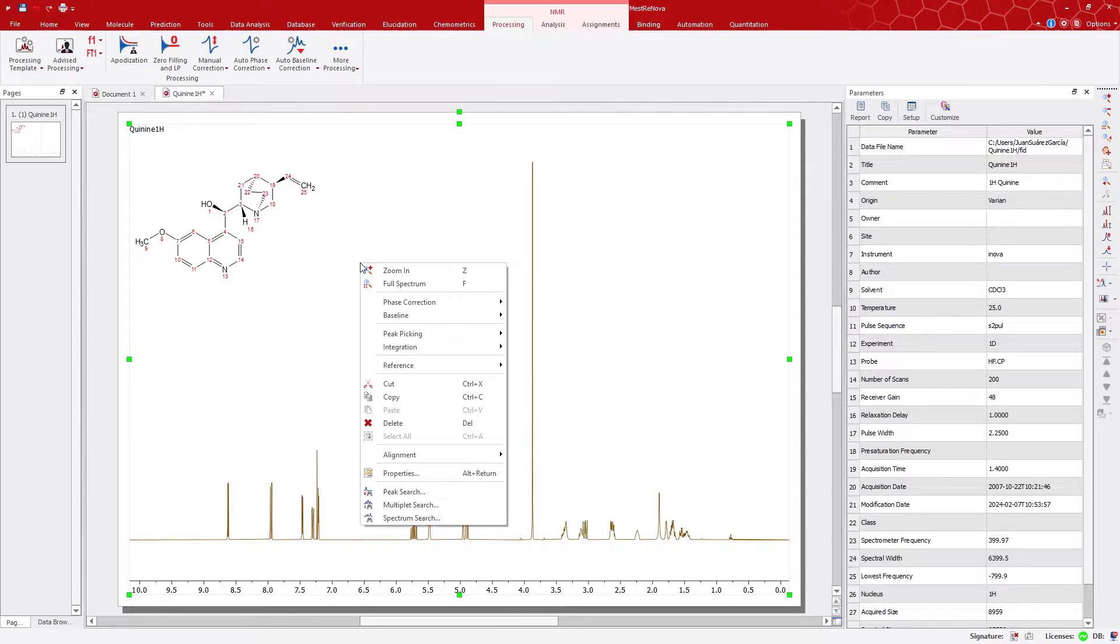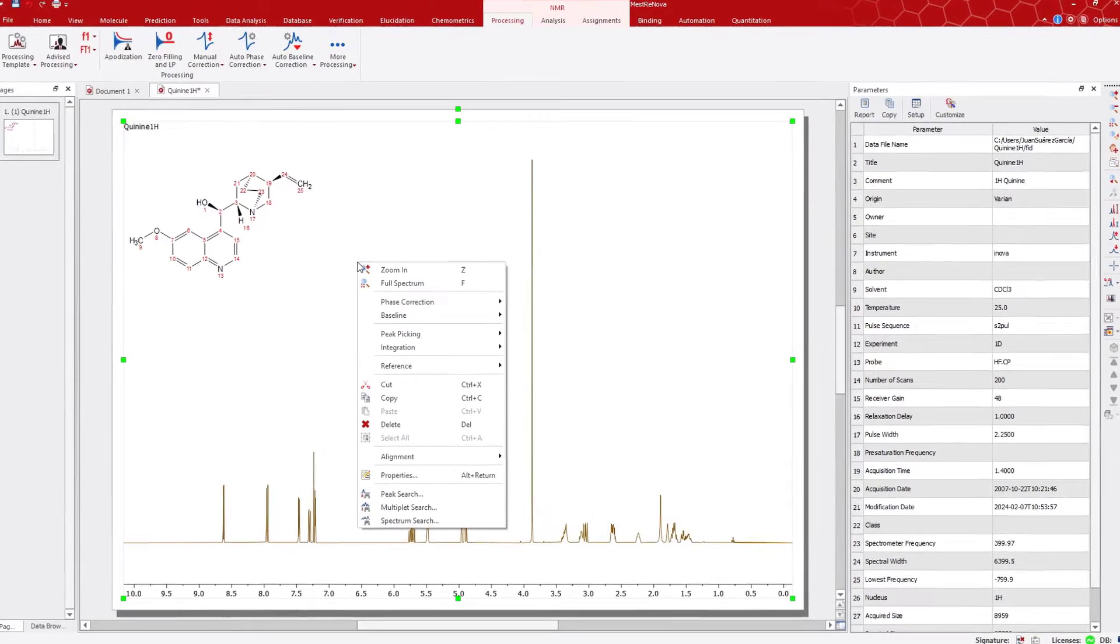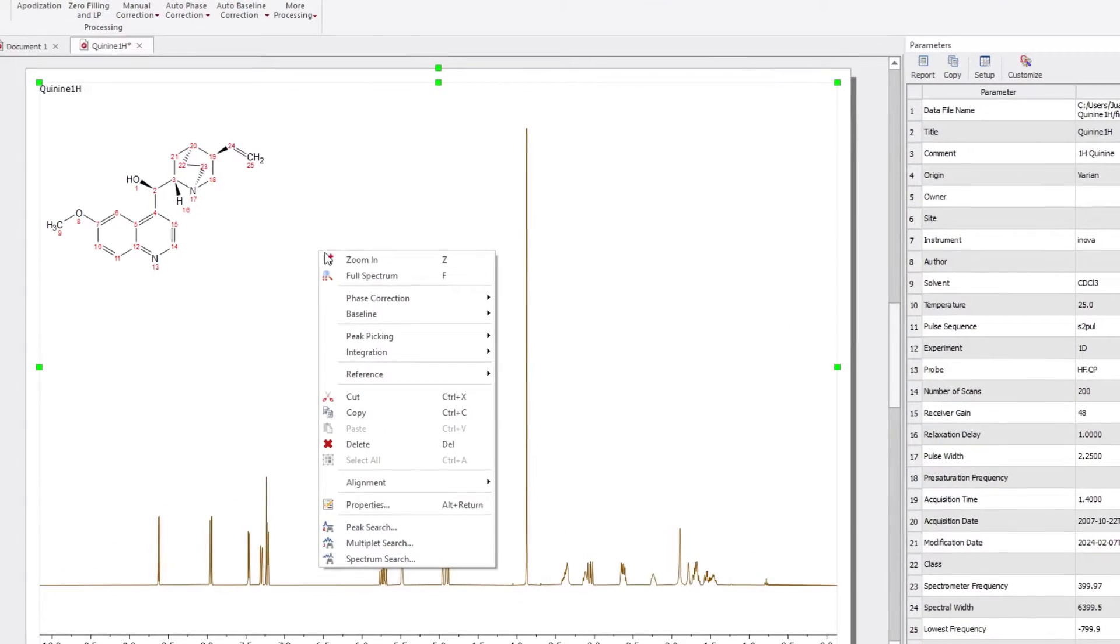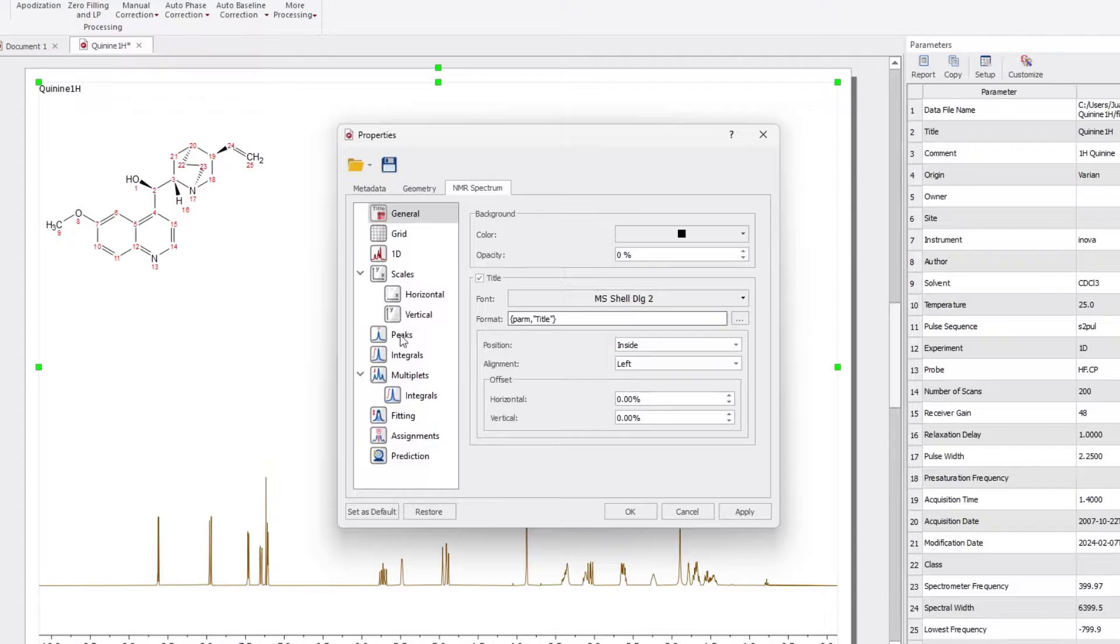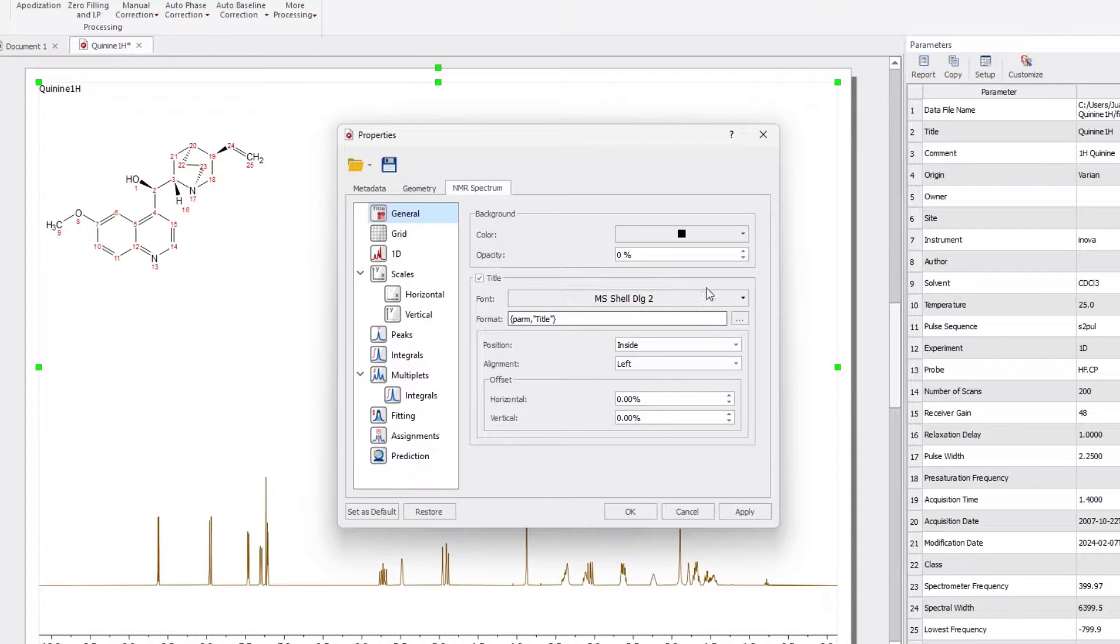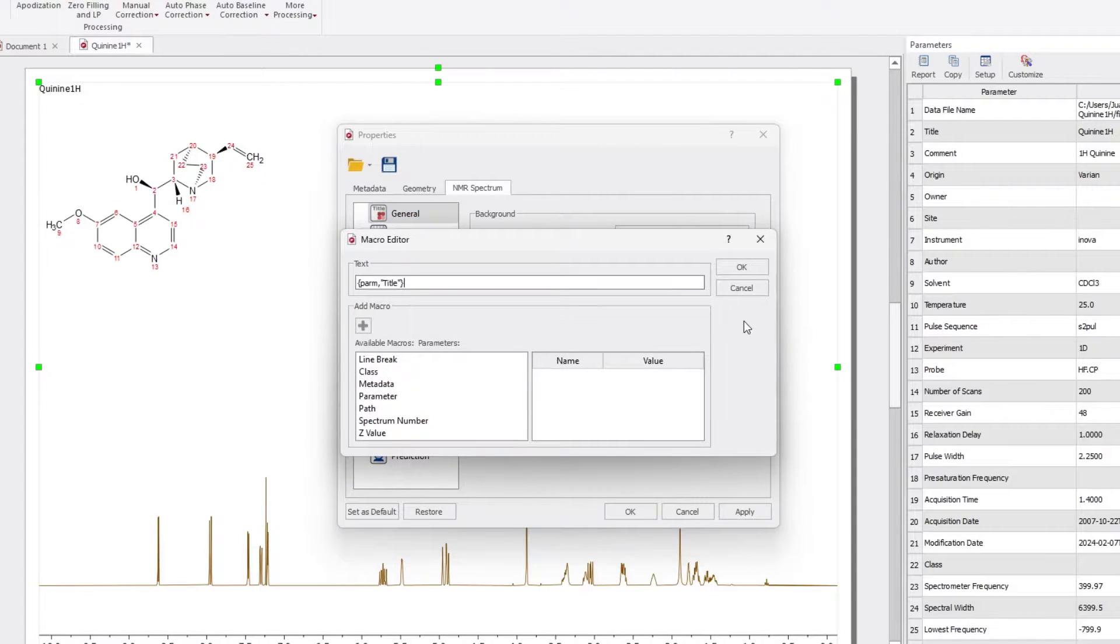Begin by right-clicking on the spectrum and selecting Properties. In the General tab, click on the three dots button in the Format options.